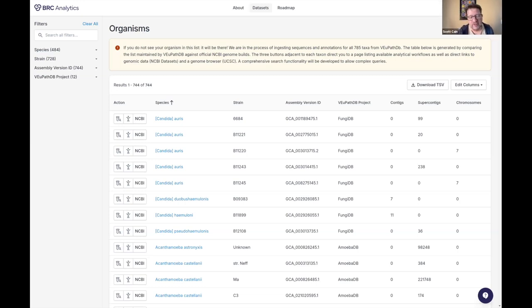Oh, actually, we do have a question. So Kristen asks, how can you move analysis results from one pipeline to another? So if you have a variant calling with results on variants in specific genes, can I use that subset to intersect with RNA-seq or ATAC-seq pipelines, that sort of thing? It's an excellent question. So yes, let me jump here.